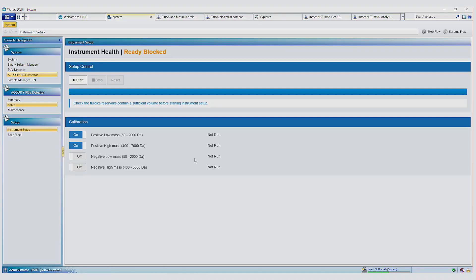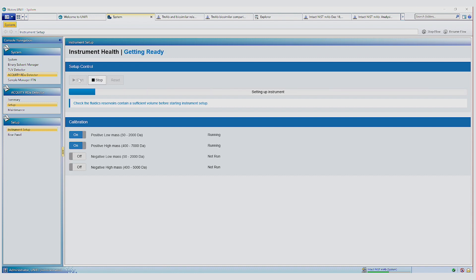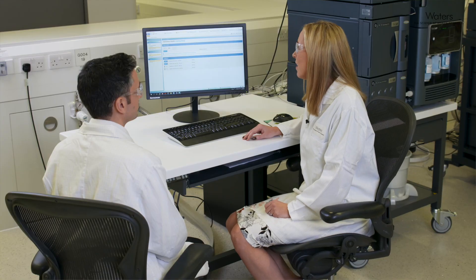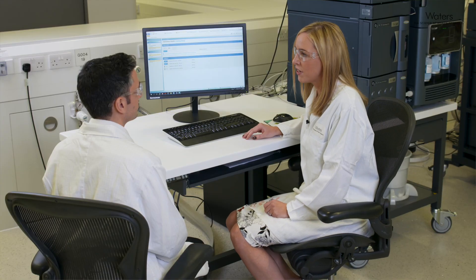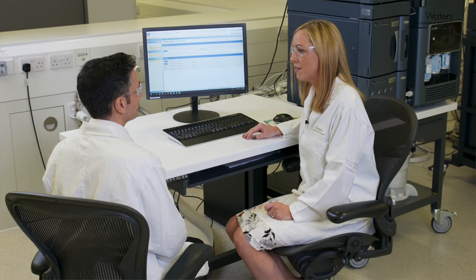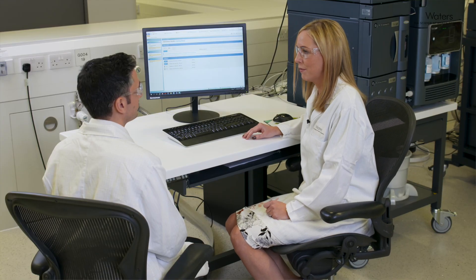So setting up the system is a simple one-click operation and it includes an auto-tune and a mass calibration up to 7000 m over z. And this process just takes a few minutes. So that's how straightforward it is to set up the system.